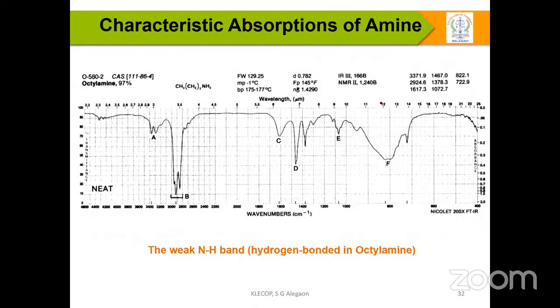Next, come to another amine, the aliphatic amine. Look at this aliphatic amine. Those who are writing IR spectroscopy in their dissertation, MSc project, or MPhil project, sometimes people will say your compound is not formed because there are no primary amine peaks. My dearest participants, you can tell them that sometimes primary and secondary amines give a very sharp and small peak.